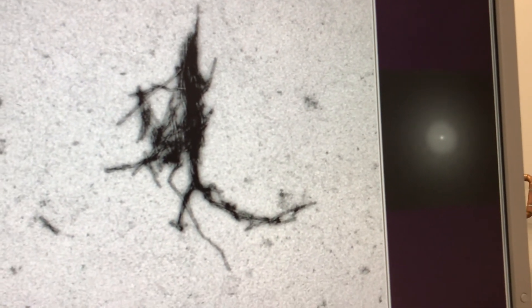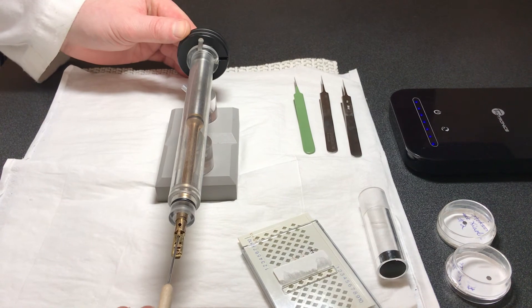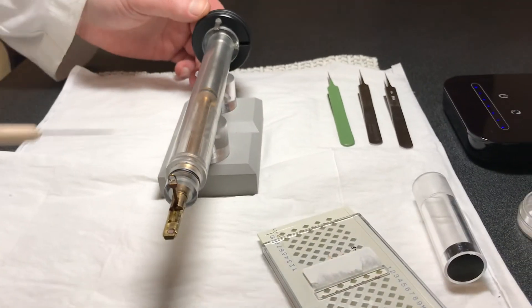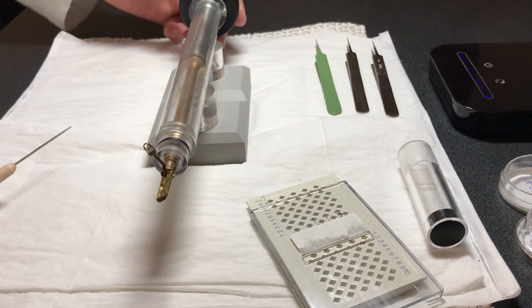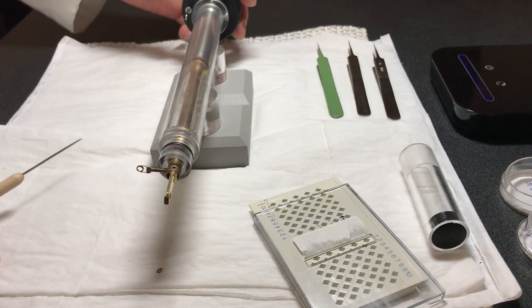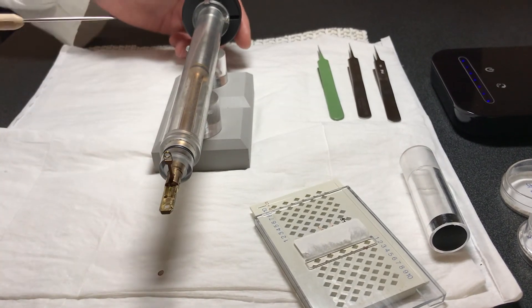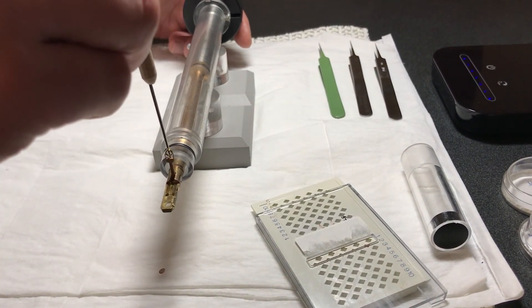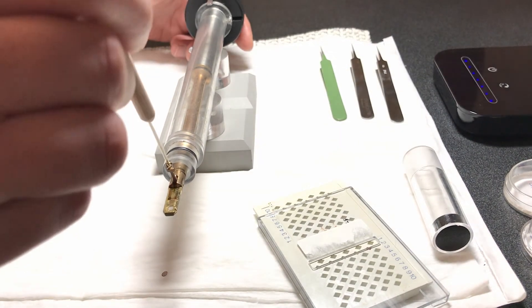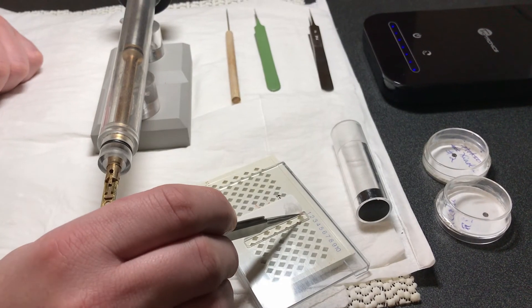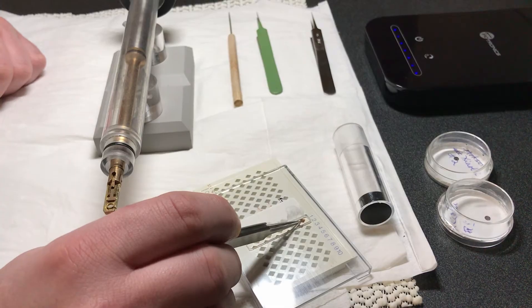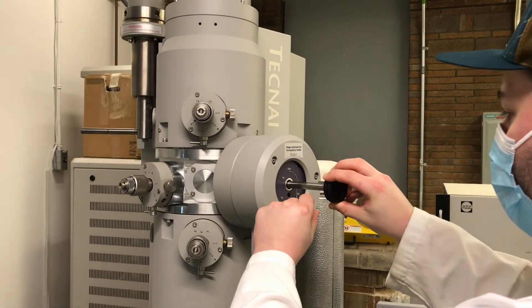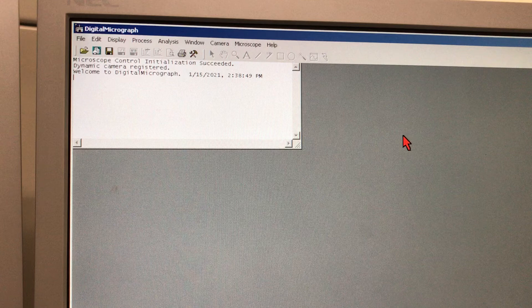Once you're done, you can remove the room temperature holder from the microscope. Using the loading pin, you can raise the clamp and then turn the holder upside down so that the grid can drop onto the working station. You can then put it back into the grid box and place the room temperature holder into the microscope again. Once you're done imaging and you determine that you don't want to continue with the session anymore, it is important to proceed with cleanup.